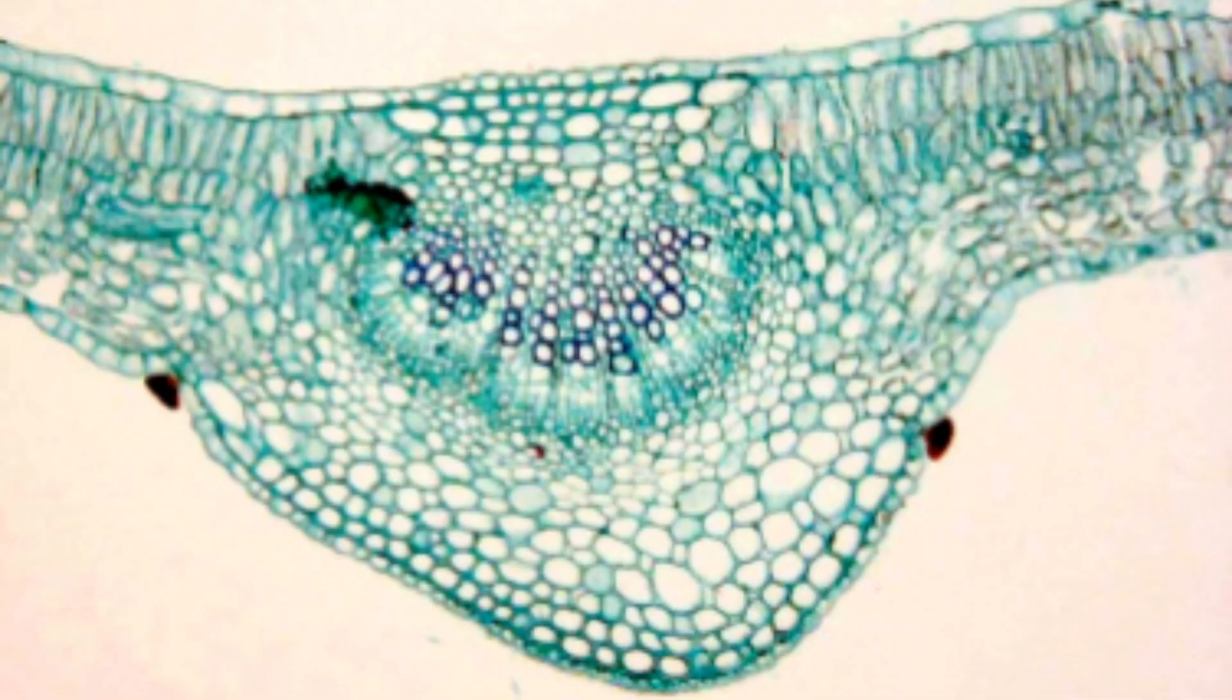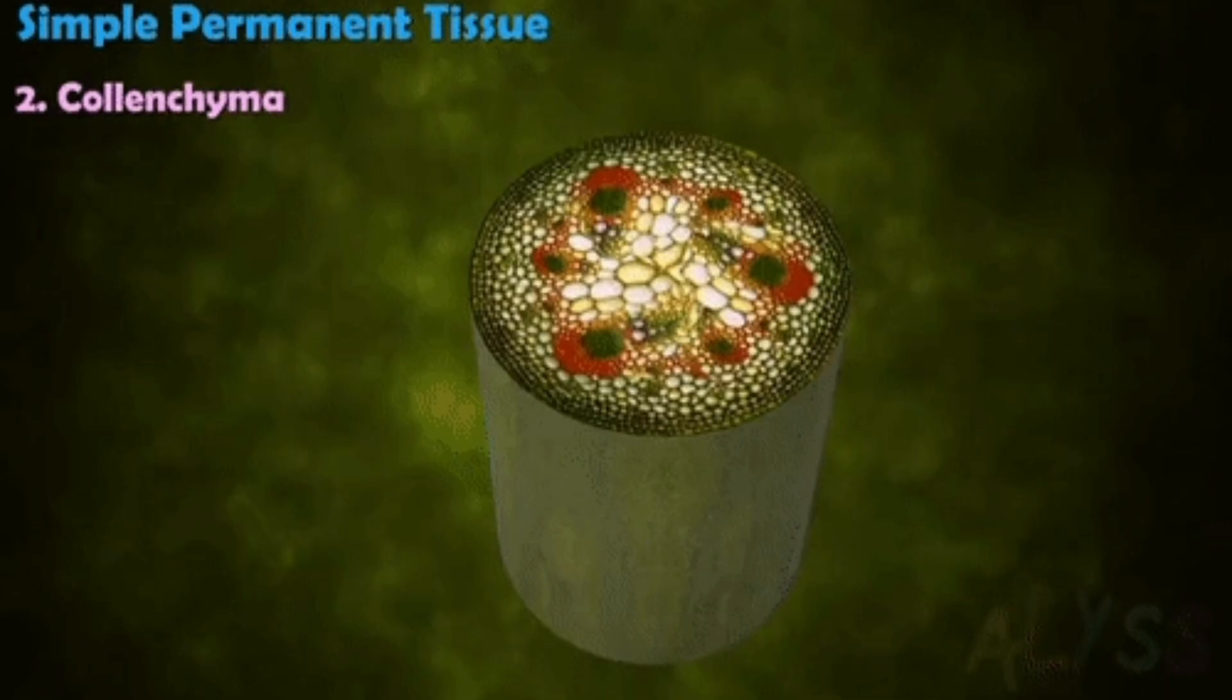This is the colenchyma tissue. The colenchyma tissue has irregularly thickened cell walls. The cell walls are thickened due to cellulose deposition, and the cells look polygonal.